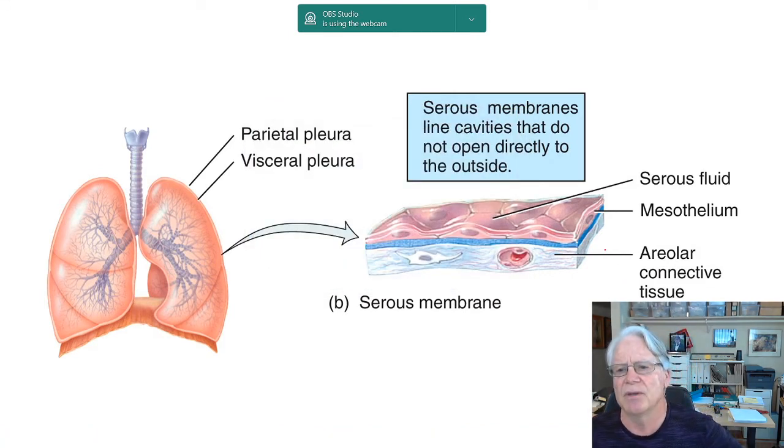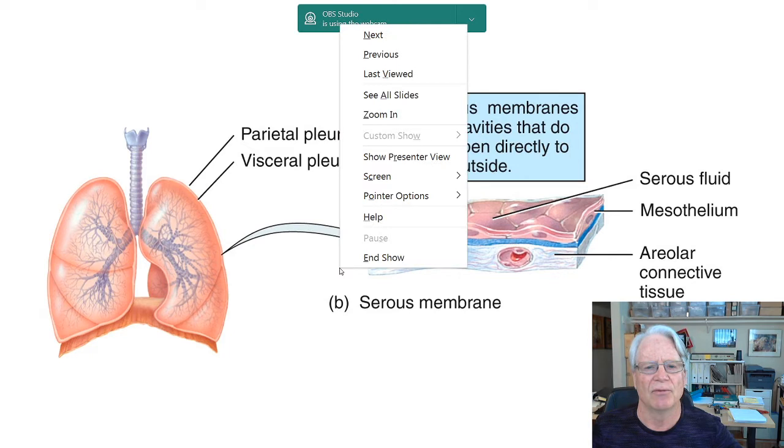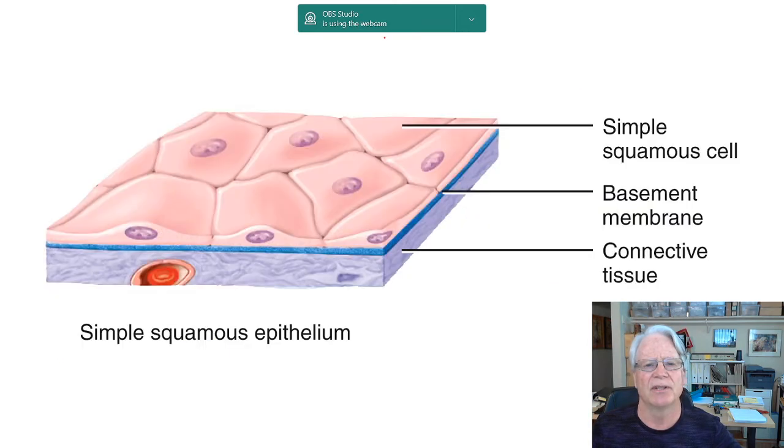And so we can see that this is exactly simple squamous epithelium. In this case, it's the serous membrane. I thought this slide was interesting just so that you can connect that idea, serous membrane, to the epithelial tissue, and see it also, again, reminding yourself of what that's all about. So going to the next slide.